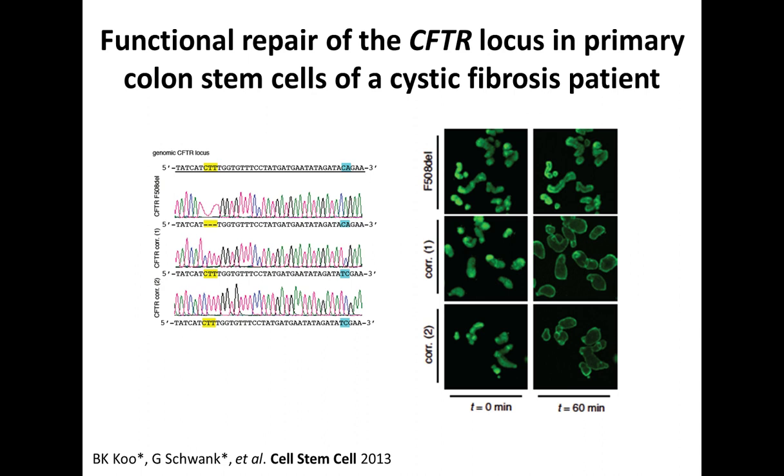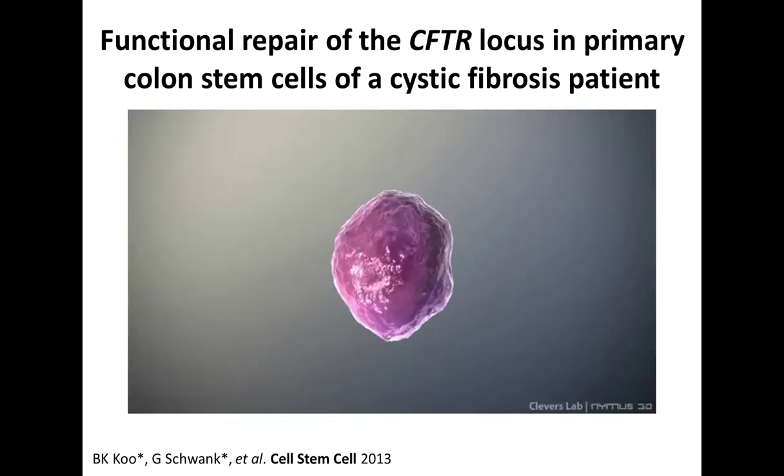If you see that, I think you can believe that we indeed did a gene correction. And after that, we found that the mutant organoid is now nicely responding to the forskolin treatment, so we were able to observe the balloon-like phenotype. With that, we had a nice paper out, and I'm going to show you a movie that summarizes the work.